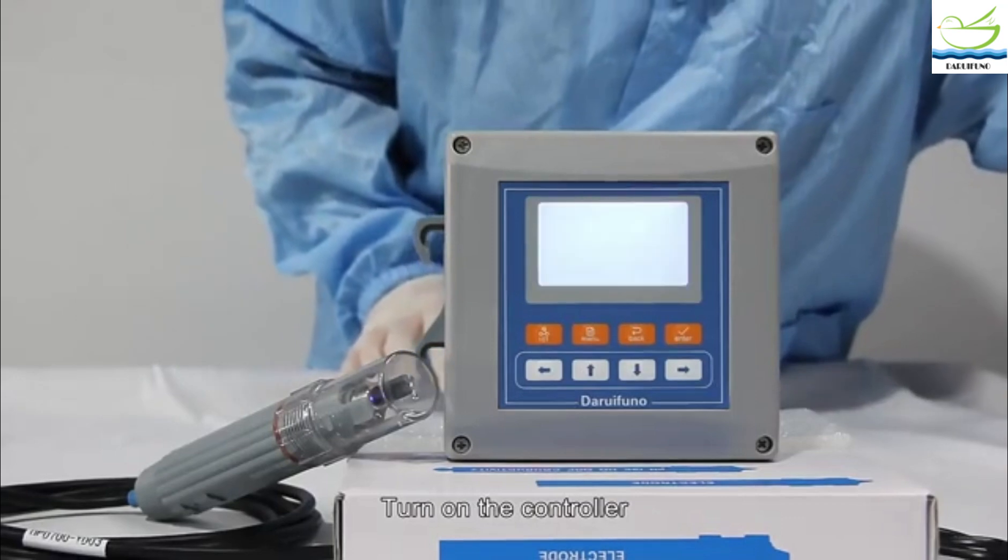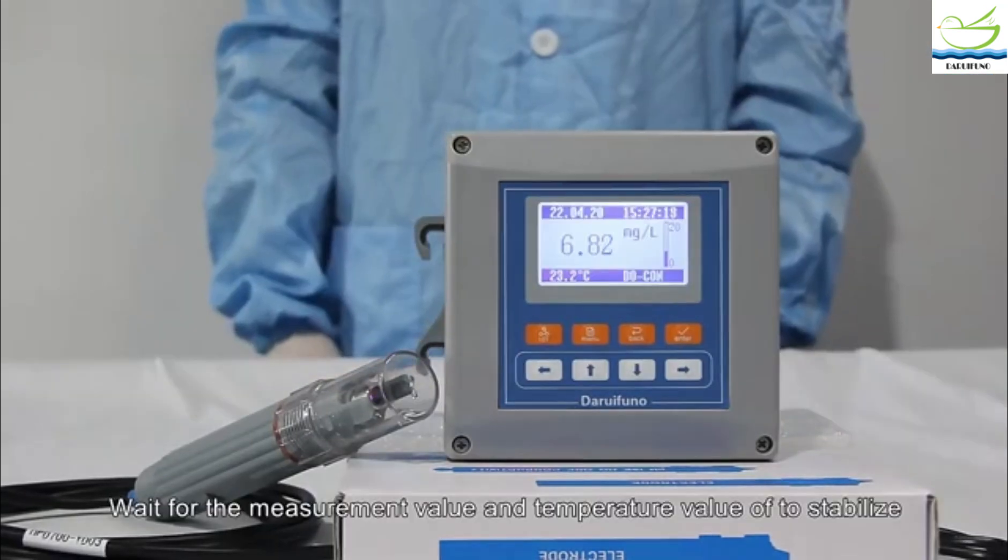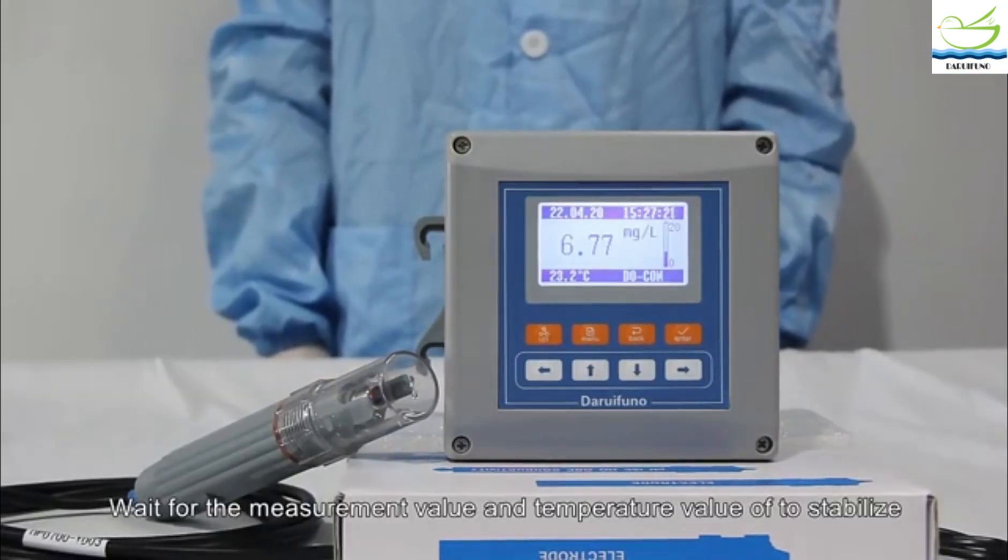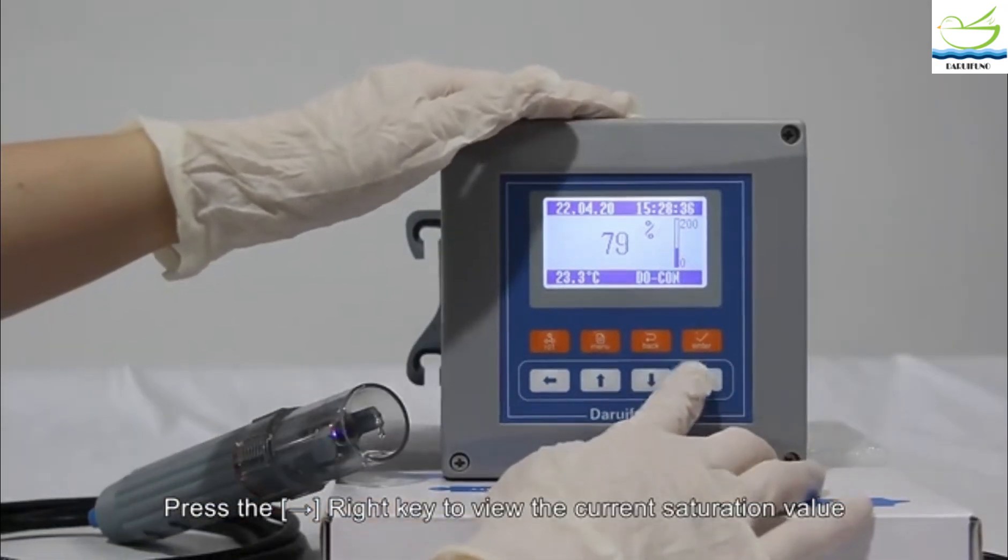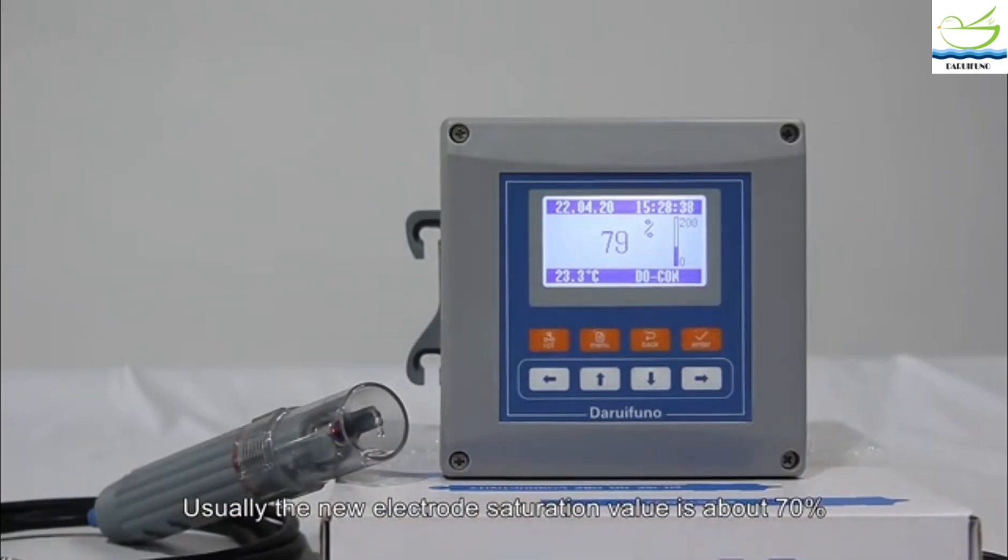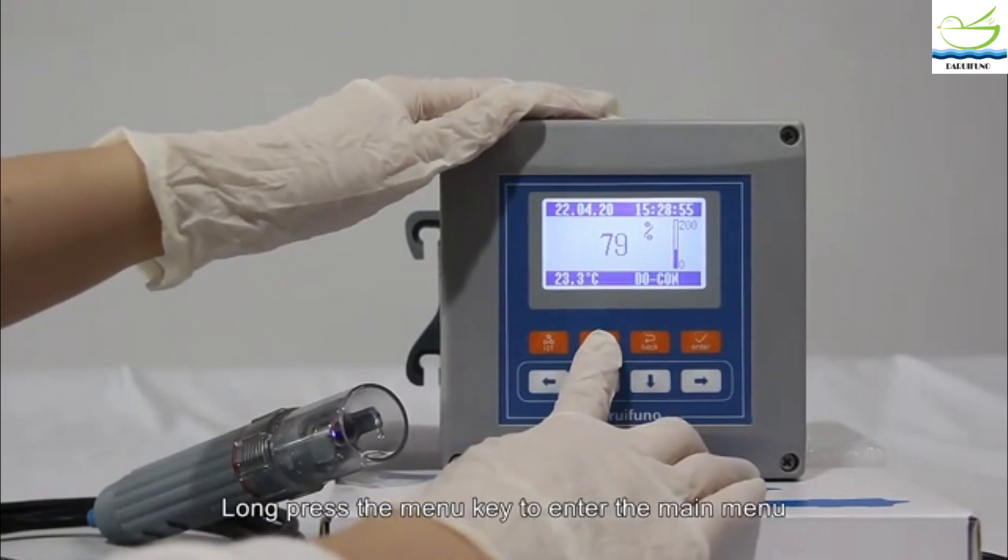Turn on the controller and wait for the measurement value and temperature value to stabilize. Press the right key to view the current saturation value. Usually the new electrode saturation value is about 70%. Let's start the calibration. Long press the menu key to enter the main menu.